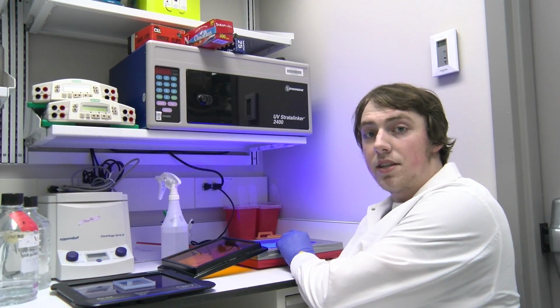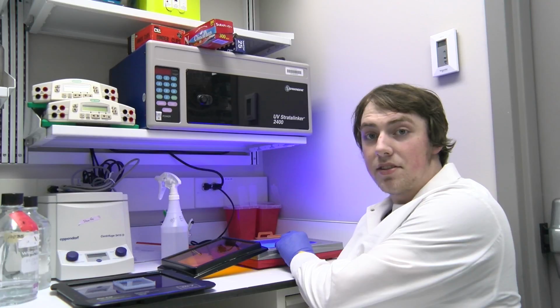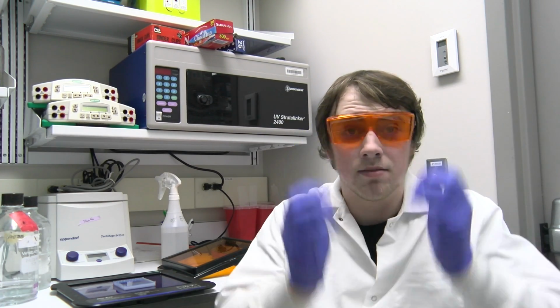Now we will cut the band out of the gel. To do this, we will place the gel on top of this UV light, which will cause the DNA fragments to emit green light, allowing us to see and cut the band. Make sure that you have protective orange eyewear to ensure that your eye isn't damaged by the harmful UV rays.